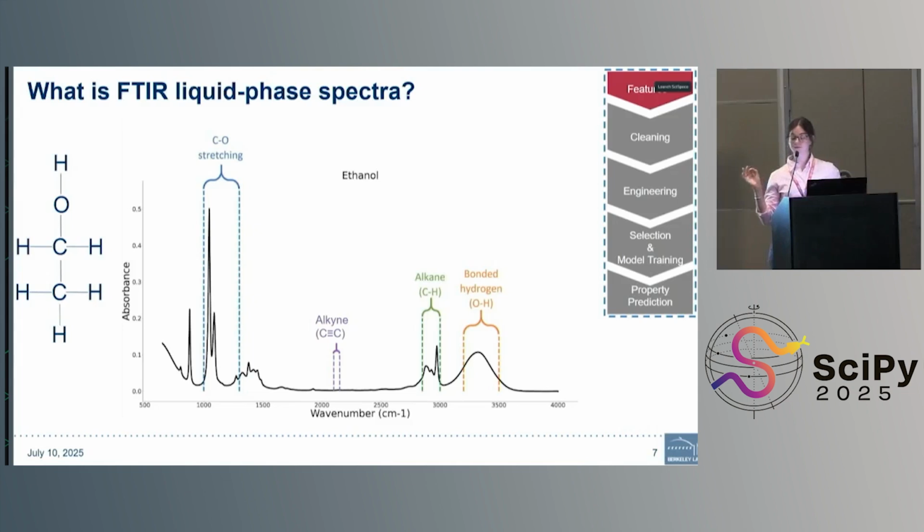And we specifically chose liquid phase FTIR spectra because it's fast, it's low volume, and it's more consistent. You really only need a few drops of the sample, and unlike with vapor phase FTIR spectra, there's no heating or pressure control component involved, and so it's a lot more practical for early stage SAF screening. And so that's great, because now we have a relatively easy and chemically rich way to represent our fuels.